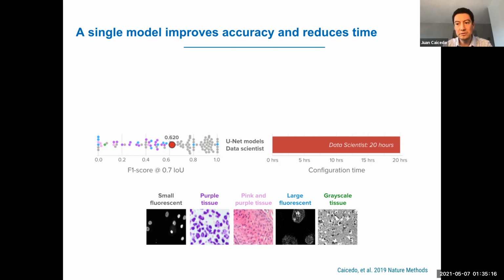Some images are also harder to annotate because they require experts really going into, saying this is an object and this is a separate object. So we definitely had fewer examples of the blue and the purple, which are the harder to segment in this case. But it would be helpful to know if different types of imaging techniques are more easily parsable than others.